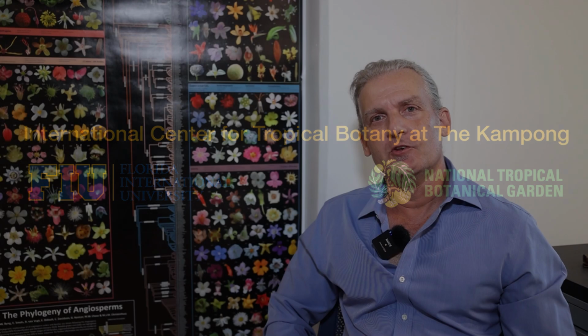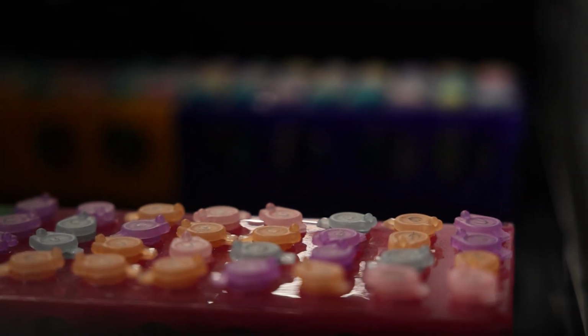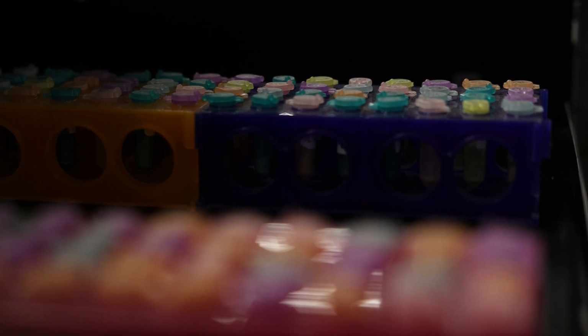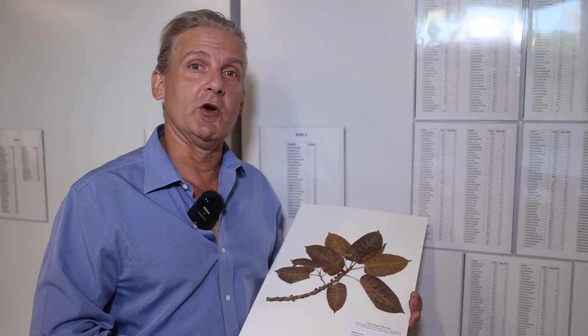Welcome to the Herbarium of the International Center for Tropical Botany at the Kampong. The objective of this facility is very simple. It's to preserve plant biodiversity collections as references for us to coordinate collections as we move forward under an era of global change. This is a typical herbarium voucher.